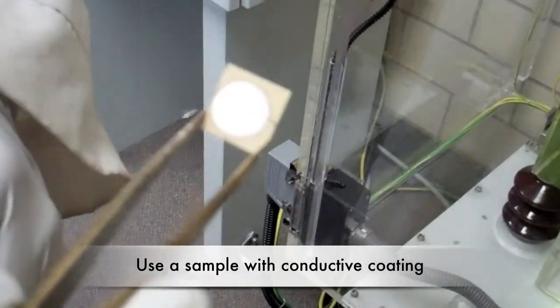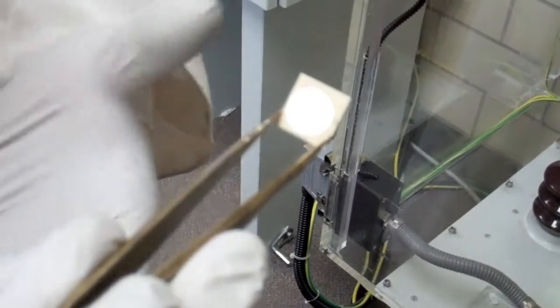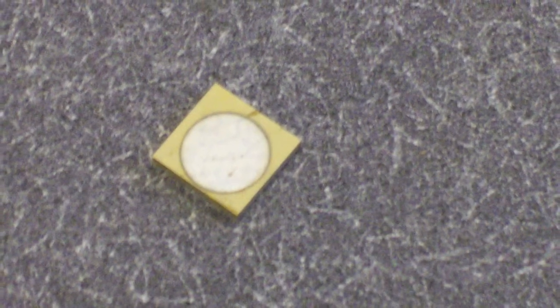The sample is made using the slow speed saw. The sample is sent to a sputtering lab where a conductive coating is applied. This ensures that there is a continuous conductive surface that will apply the voltage over the entire sample.